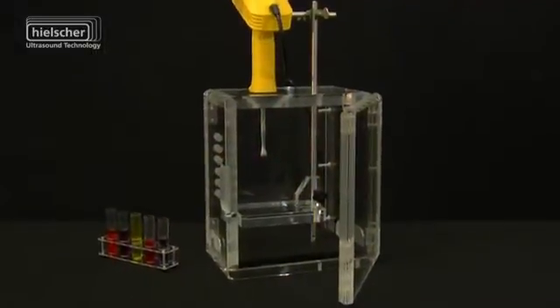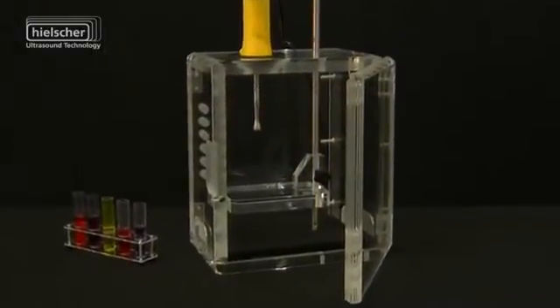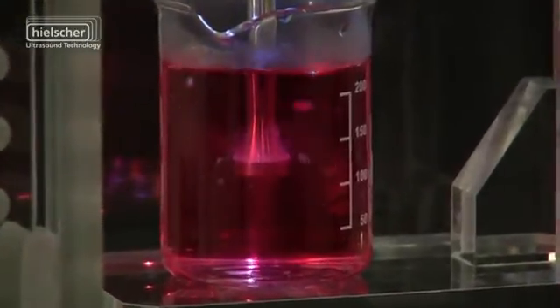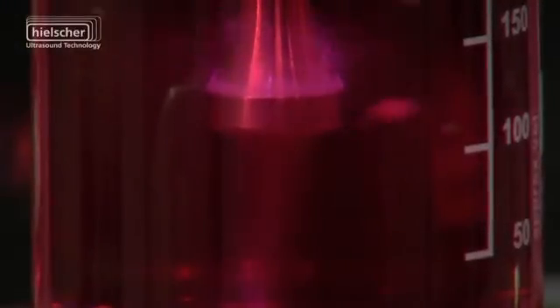The optional sound protection box SPBL, made of acrylic glass, provides additional noise reduction, advanced security protection and convenient monitoring of the sonication process.